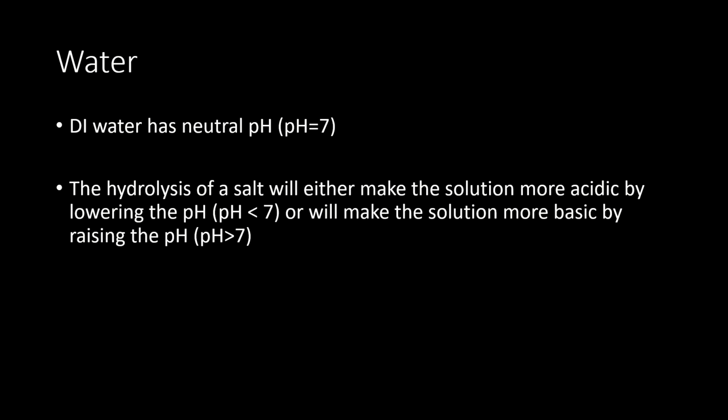Normally, DI water is neutral and has a pH of 7. If for a lab we don't have access to DI water, then water from the sink might have a slightly off neutral pH, maybe slightly acidic or slightly basic.